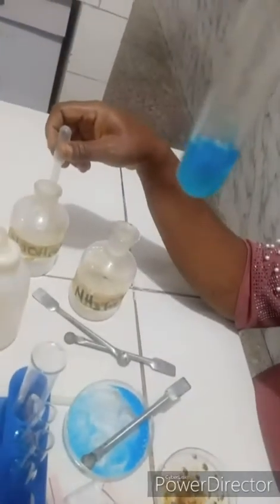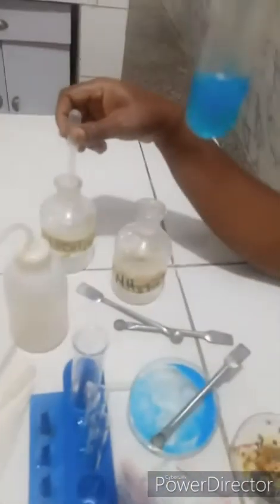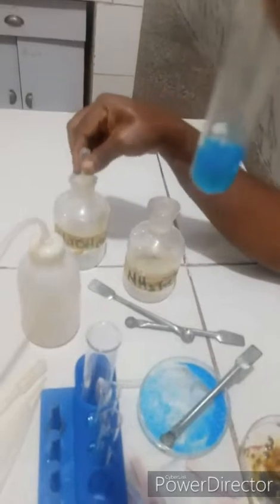You can also abbreviate your precipitate as ppt in small letters. The inference is Cu2+, copper 2 plus present, as you can see in the table. The confirmatory test, add sodium hydroxide in drops and then in excess. Each step is followed. I'm adding in excess, pour it in excess quantity. You can see that I'm adding excess quantity.